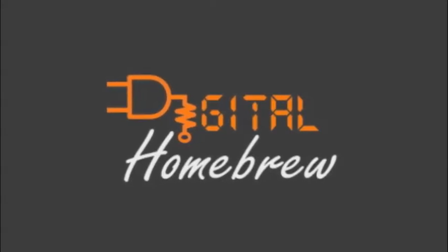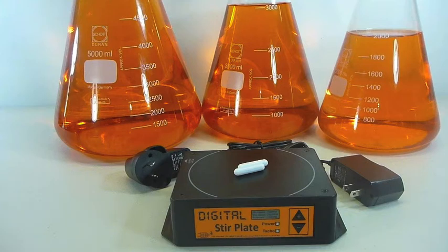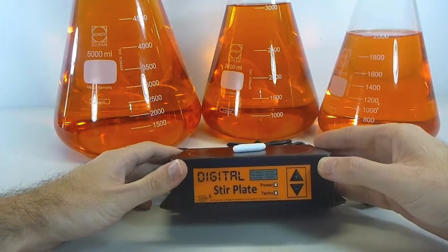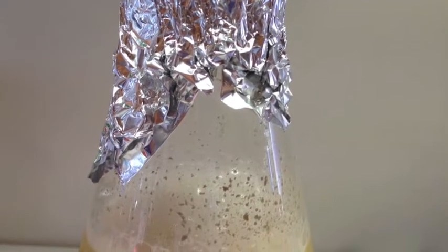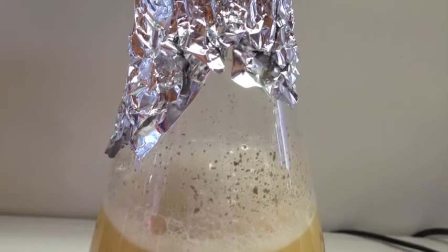Hi, it's Michael here from digitalhomebrew.com and I just wanted to introduce you to our new digital stir plate that we've just released for sale. The digital stir plate is a magnetic stirrer and it's a really unique design that's designed especially for brewers and growing yeast starters. When you're growing a yeast starter, you're trying to build a yeast colony that's large enough for the correct pitching rate for the beer that you're trying to brew.